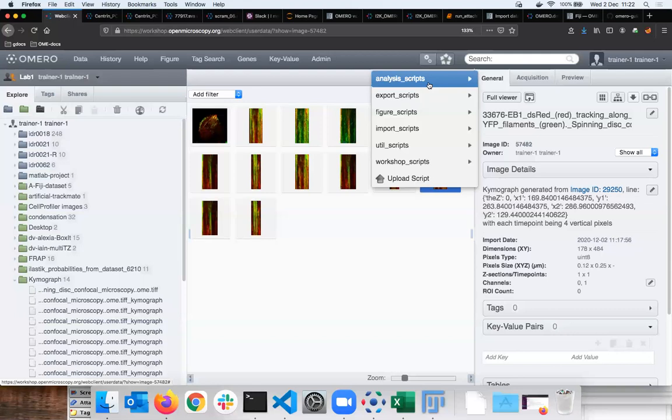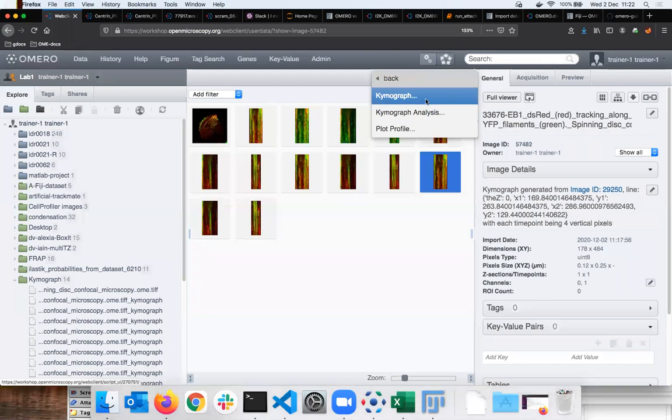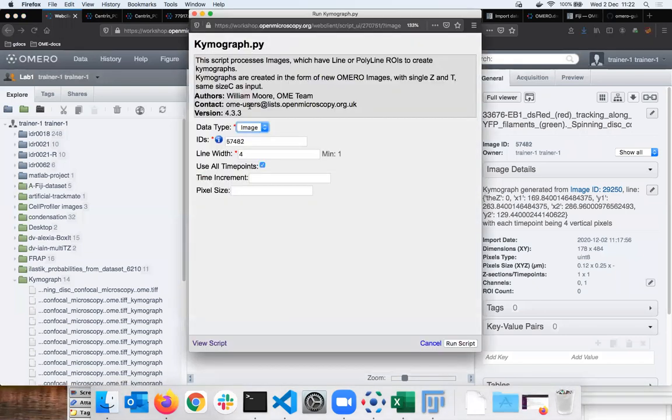So you have a small user interface which pops up when you click on the script. This is a form, a kind of matrix which you can simply manipulate and change in the script as you see fit. And you don't have to program this user interface.